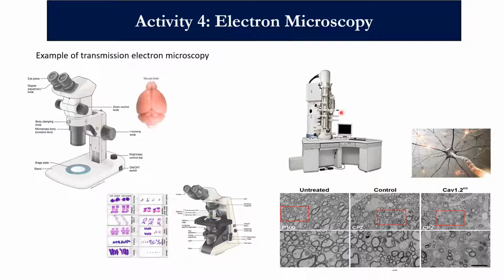And then you go to use this microscope. This is your transmission electron microscope. And that's how you can obtain these images now. And that is really just cutting a cross-section of this, and looking at the circular portion of the axons.